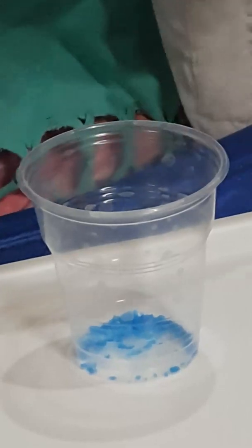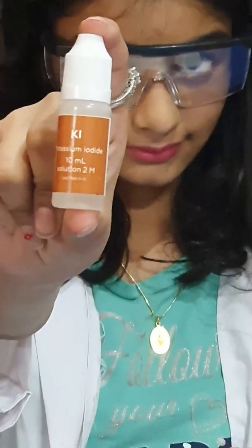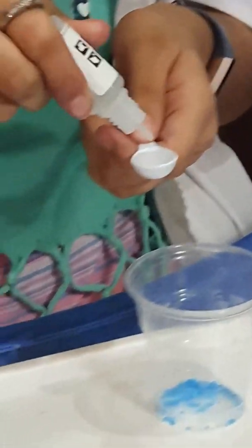One big spoon of this — potassium iodide — all of this, like the whole big spoon of this.